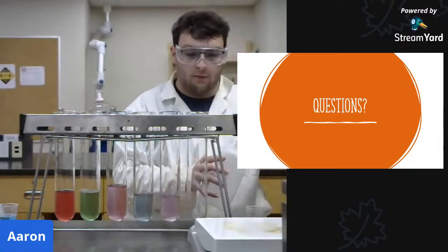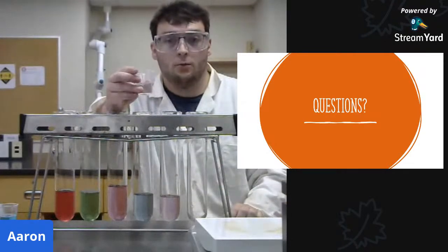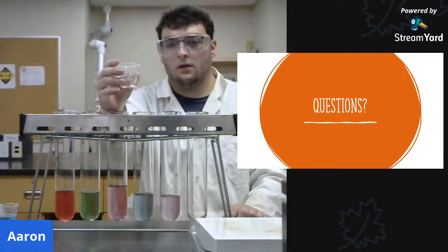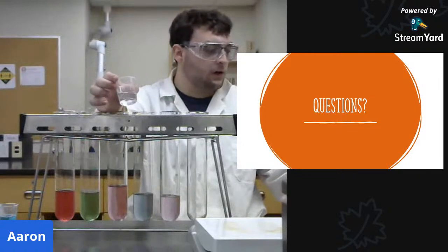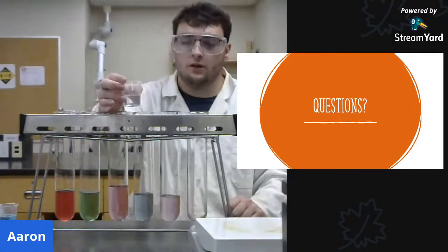So I'm just going to add a little bit. Does anybody have any guesses of what the isopropyl alcohol might do? Just a clear liquid. This is pretty concentrated, about 70%. Kills any germs it comes in contact with.